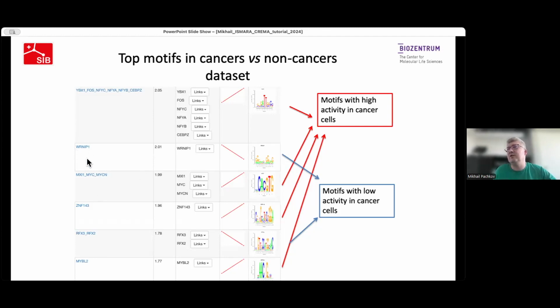This one, which goes down, is very important for DNA repair, and dysfunction of DNA repair mechanisms is actually also one of the cancer indicators. MYC, MYCN and related transcription factors are very well known oncogenes, and you see they are strongly up in the cancers. This one was shown to be an important transcription factor for cell proliferation and also extremely active in the cancer cell.